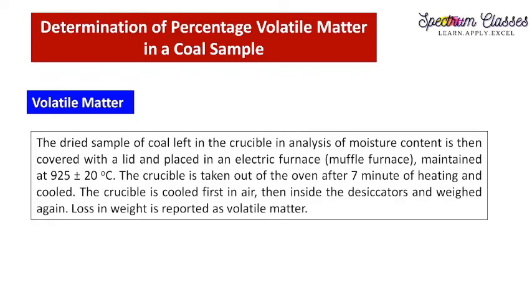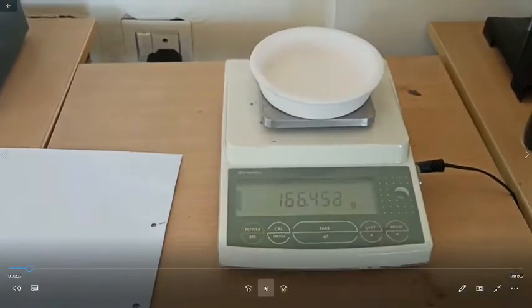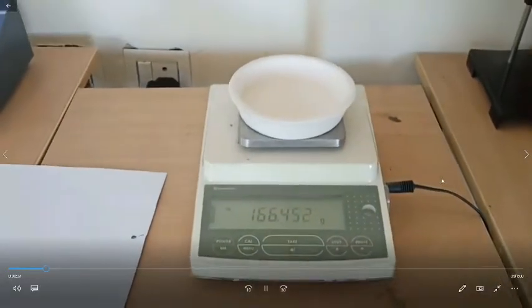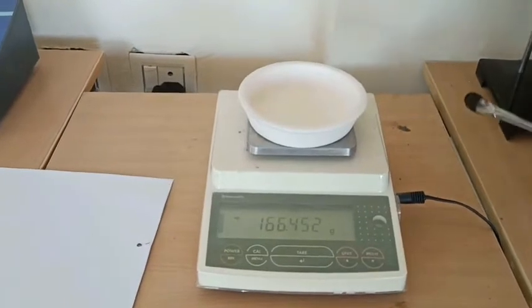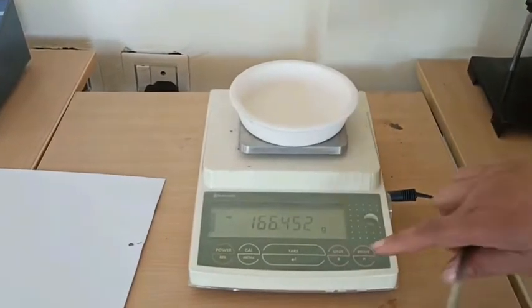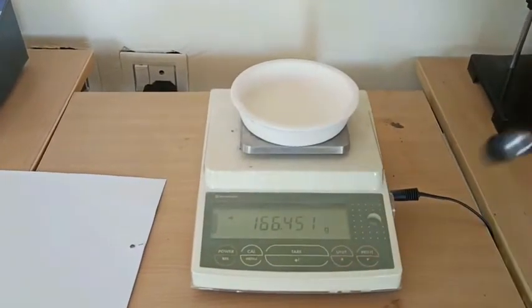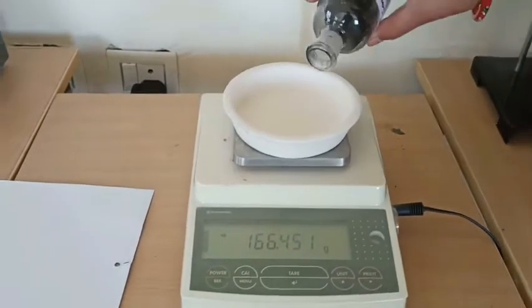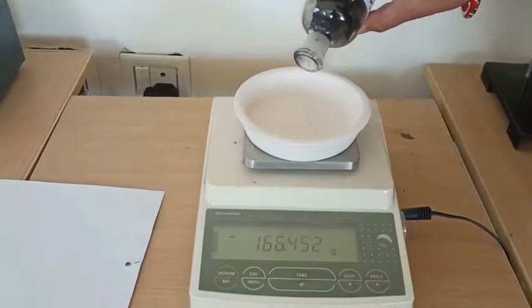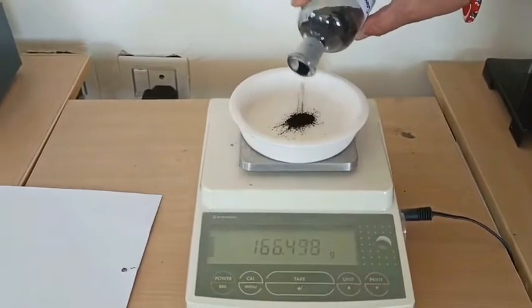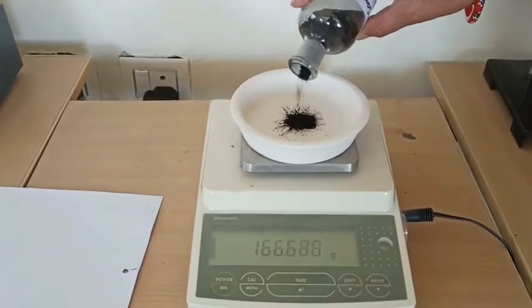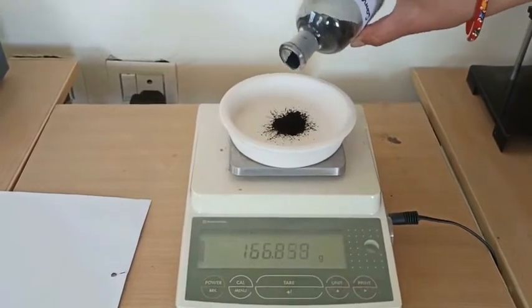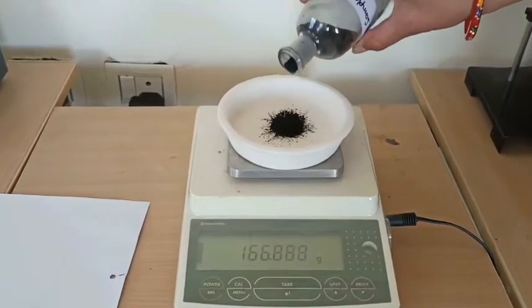Here we are going to weigh the coal sample which is obtained from experiment one — that is, after removing the moisture content. So this coal sample is from experiment one, removing moisture content.